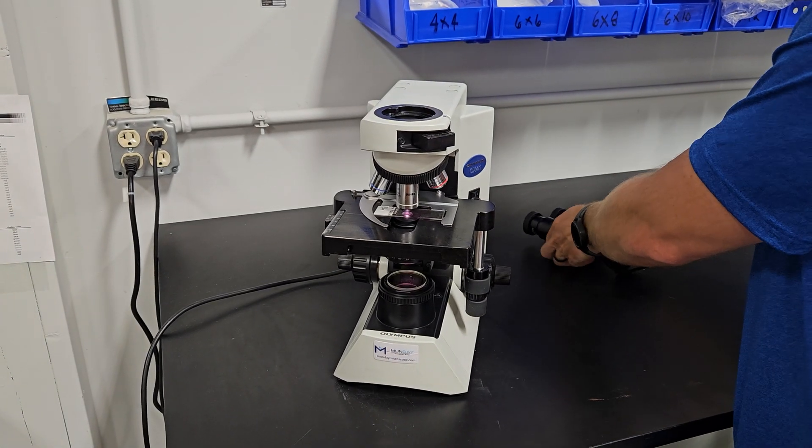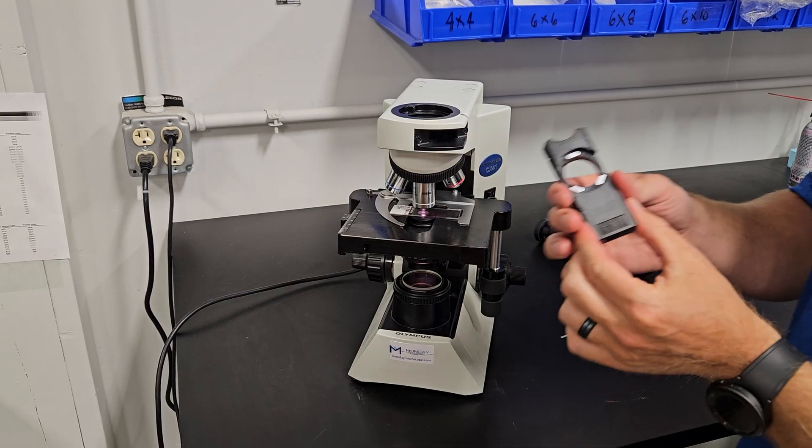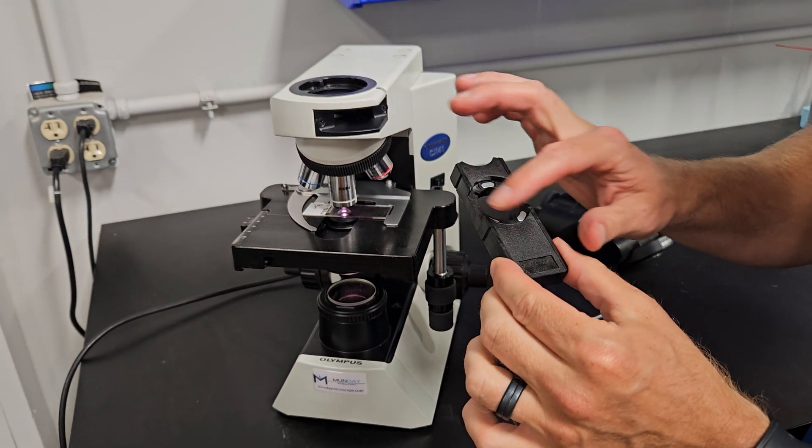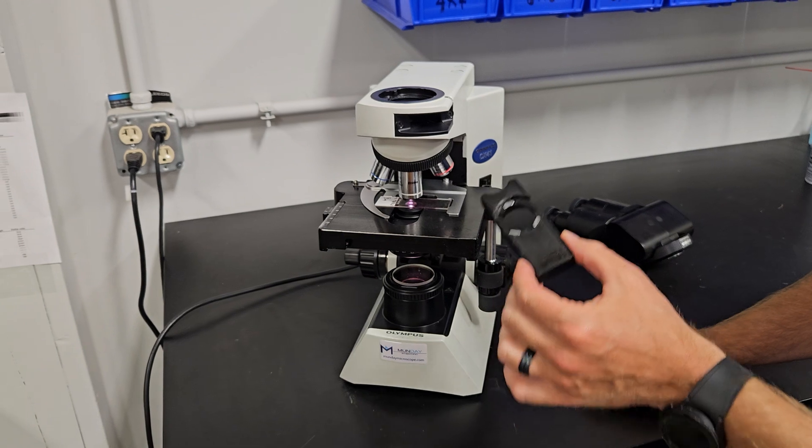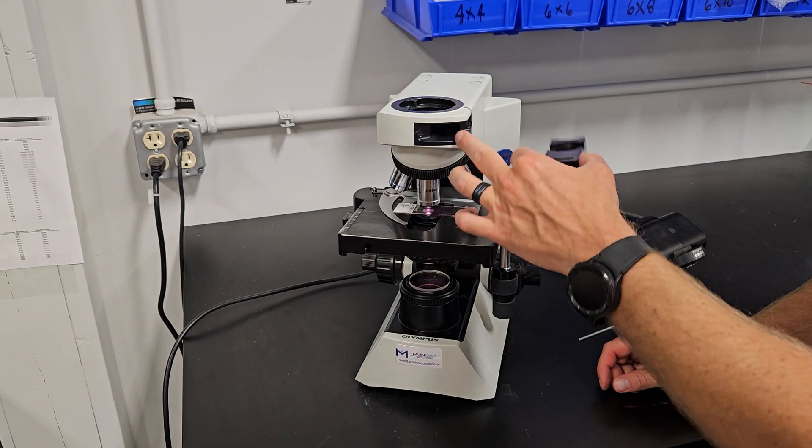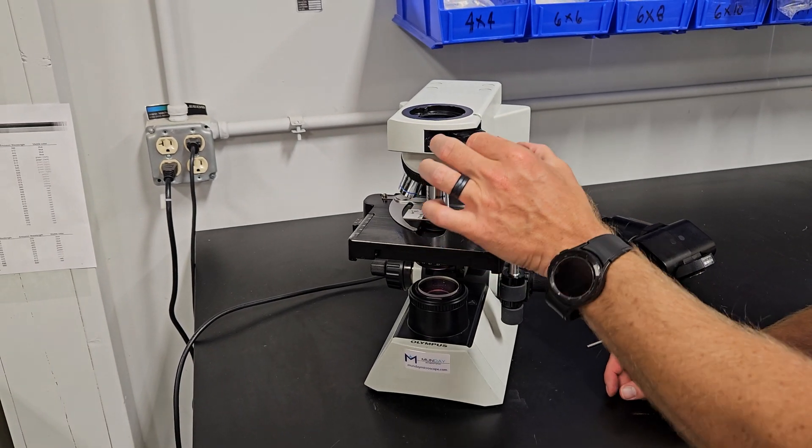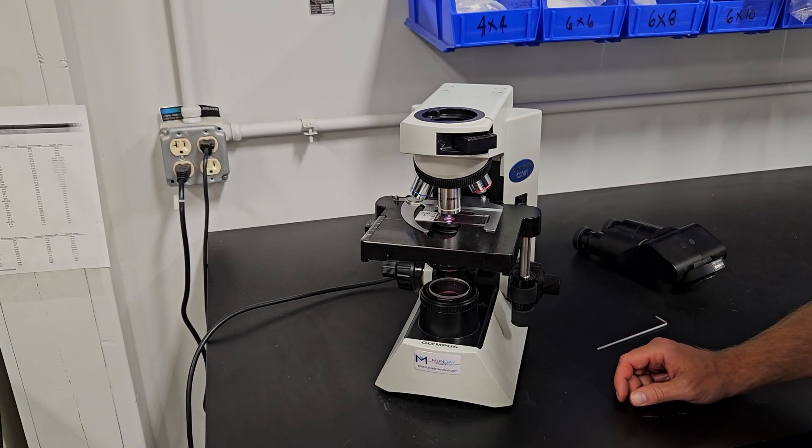Let's set this off to the side. This right here is where you would put the analyzer. If you decided you needed an analyzer on this microscope, you can also put a U-GAN in here if you needed to do Congo red or gout.